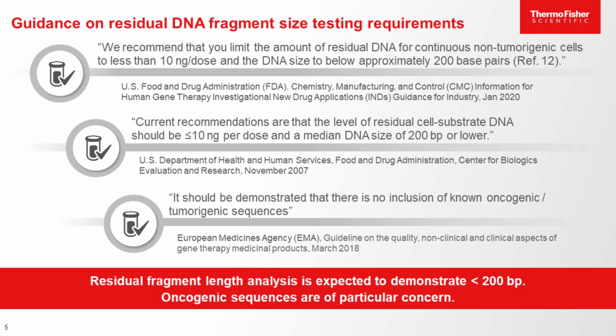And then in addition to that is also a concern for oncogenes, right, that are coming from various regulatory agencies here as well. And if we take a look at the third one from the EMA, EMA specifically indicates to demonstrate the absence of known oncogenes, right? And especially here, encapsulation in viral vector products.